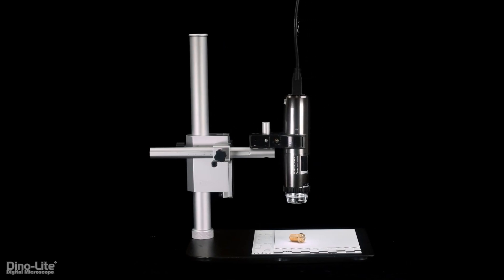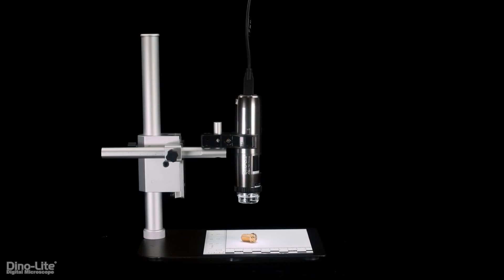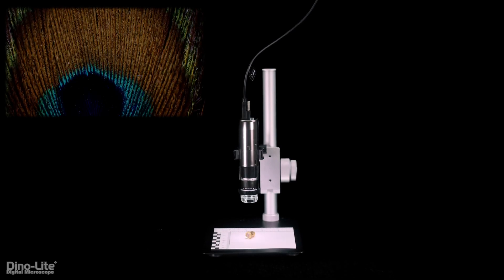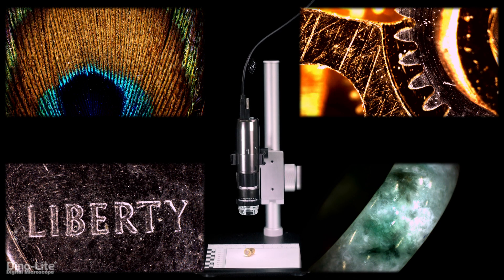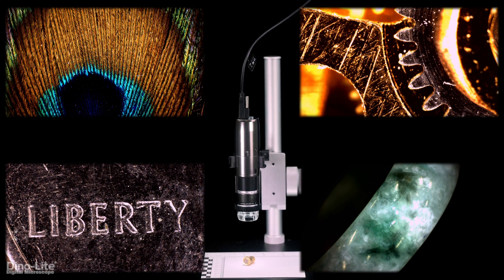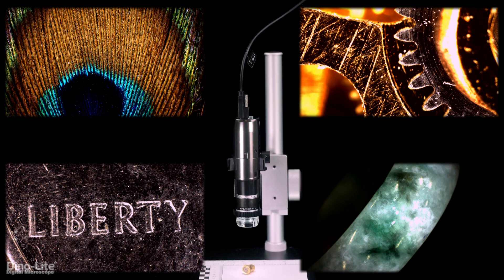Introducing the new 8MP Dynolite Edge Plus Digital Microscopes. With our improved optics design, these powerful digital microscopes provide a new class of high resolution images and video with unparalleled color fidelity.